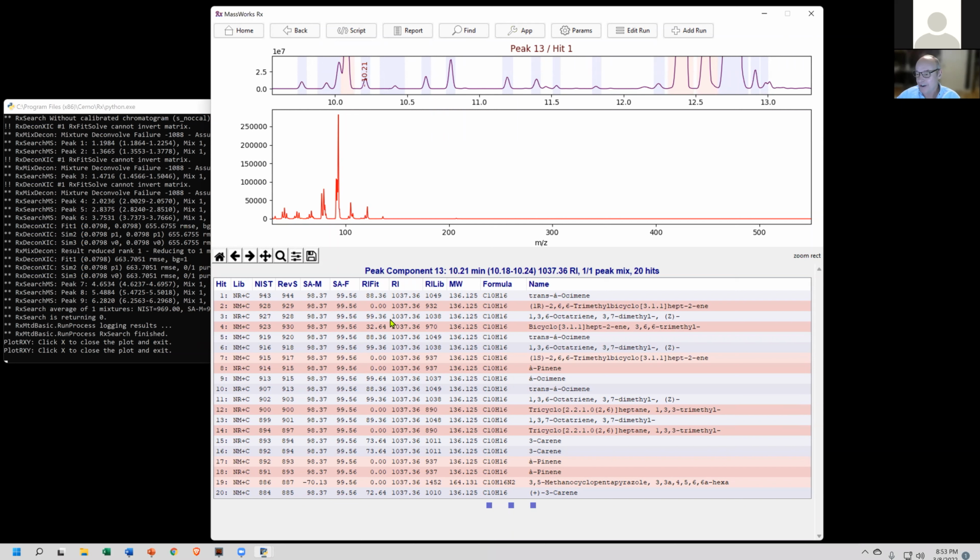Now this match here, which is this particular isomer, has a very good retention index fit. And you can see that there's also a replica of it in the library. That's the replica. That's in the main. That's the same compound. Of course, they both have the same retention index, excellent fit value, and same formula. The search results are a little bit lower, but they're still really excellent. So with a high degree of confidence, I can identify the compound that previously, without this information, you would have had very little hope to identify properly.